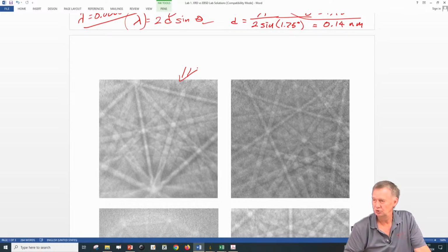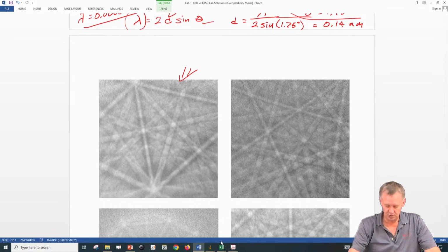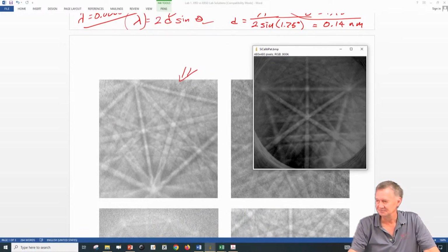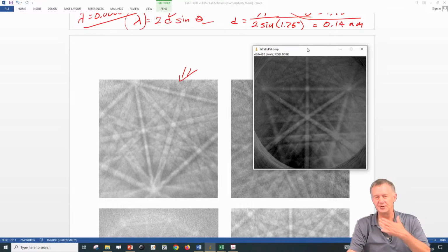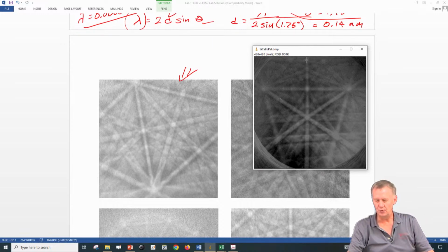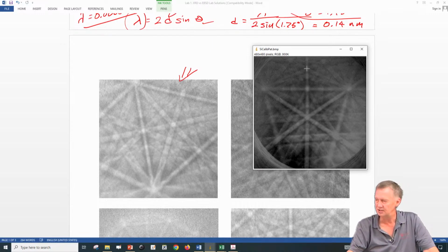So one question is, how do you determine the pattern center? So if we were to look at this pattern, silicon calibration sample, right? This is the cheating one where we know 110 up here is normal to the surface of the specimen, and we know 20 degrees away is 114, which is right there, right? So if we have a piece of silicon that we line up with the 110 plane, with the 110 cleavage plane lined up vertically, we put that specimen in, we'll have a 114 exactly at the position of the pattern center because it's 20 degrees away and we're tilted 70 degrees. Okay? It's actually 19.4 degrees, so we have to be tilted 70.6 degrees to be exact. But our pattern center would be right at that zone axis.